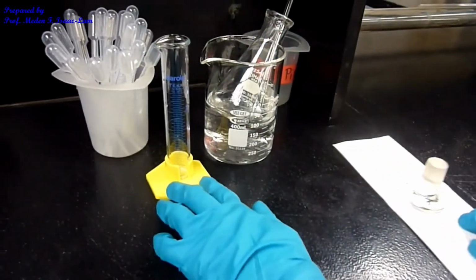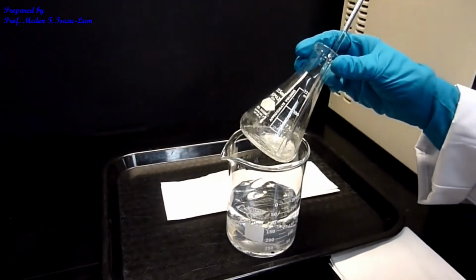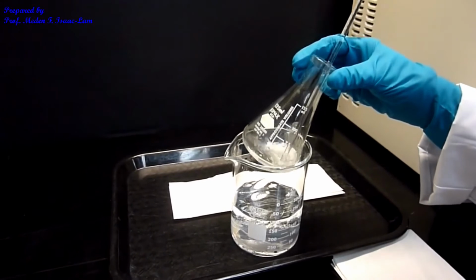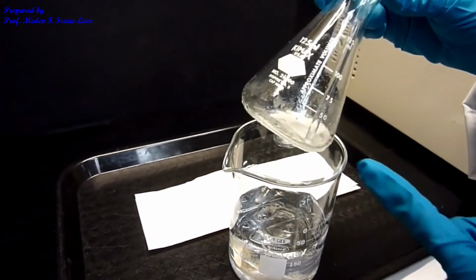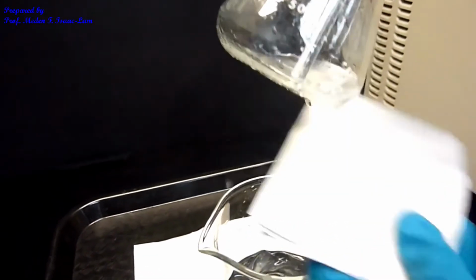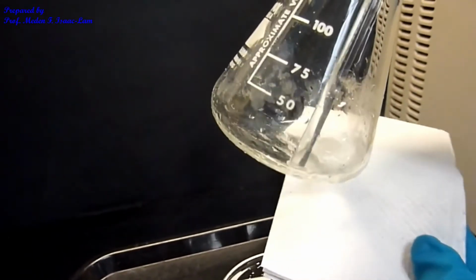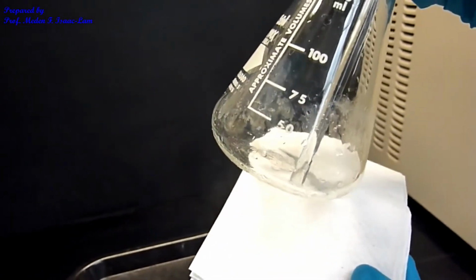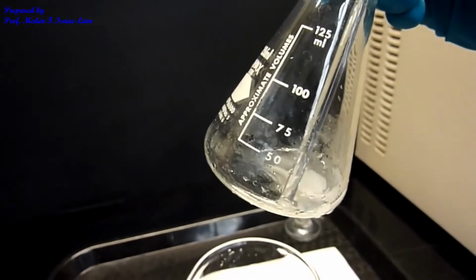So we let it sit for 5 minutes. After about almost 10 minutes of scratching and chilling in ice water, the blob is not precipitating out, but there's like a cloudiness at the bottom, as you can see. So it's cloudy. There's an oil at the bottom. That's the product, but it's not coming out of solution. It's not precipitating out.